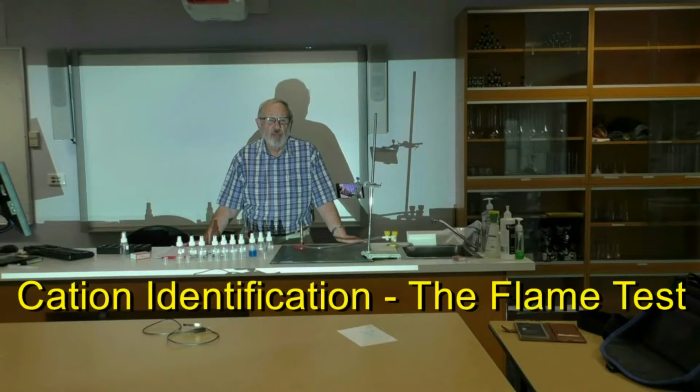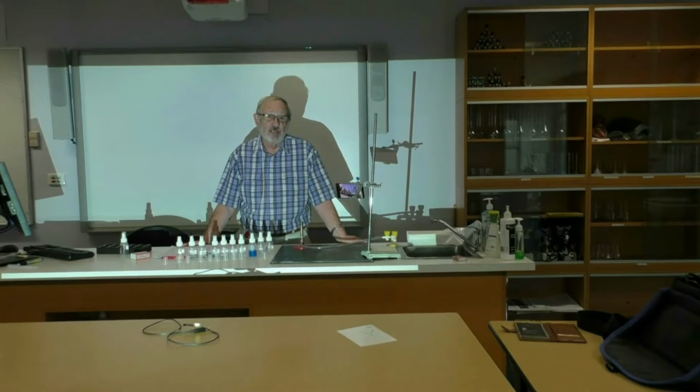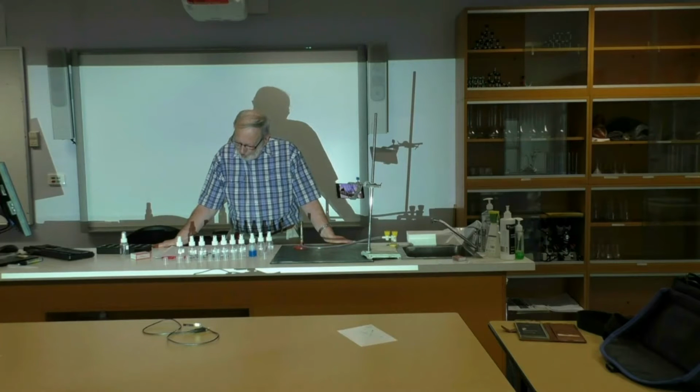We're going to have a look now at identifying cations. These are positively charged and usually metal ions. And in your workbook, you'll see one of the ways in which we can do this, and it is called the flame test.